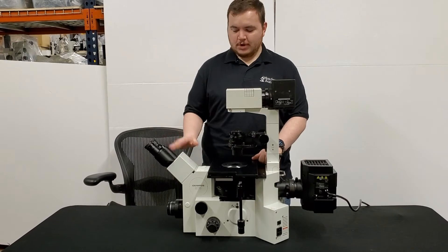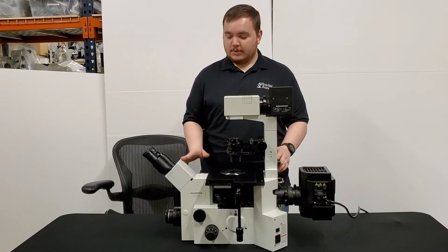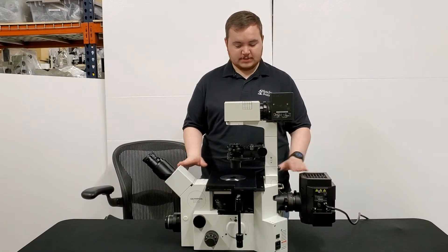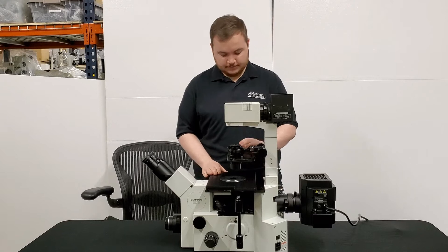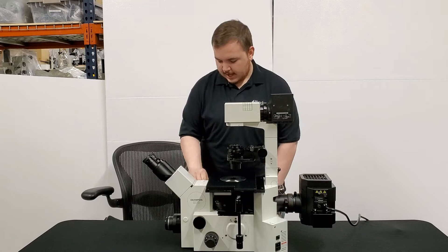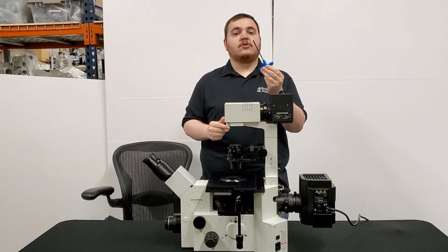To start off, we're going to go over what components you're going to be removing on the microscope, as well as what tools you'll need. We're going to be removing the head, upper arm, and rear lamp house, as well as the stage and condenser. You're going to need your 3mm wrench, that's included with your Olympus microscope, and you're also going to need a 4mm wrench. We just have a T-handle here because that makes it a little bit easier.